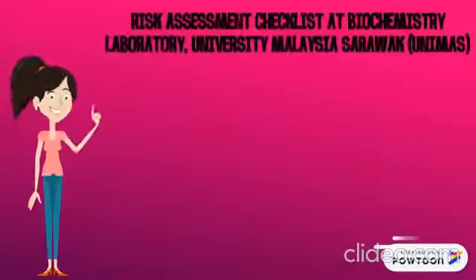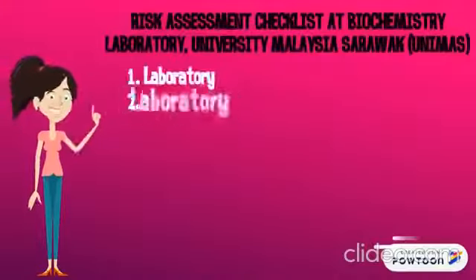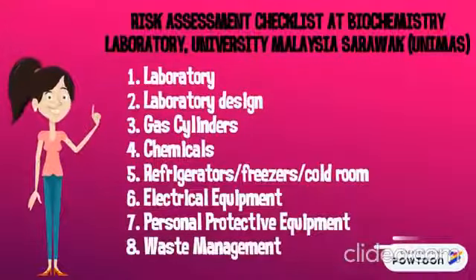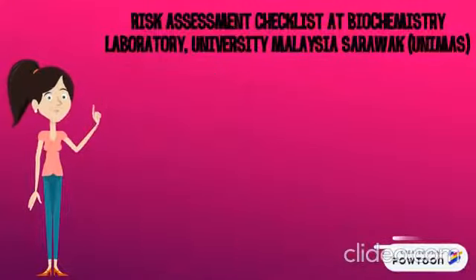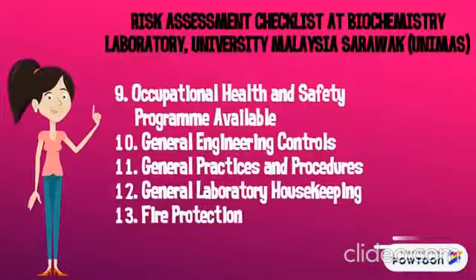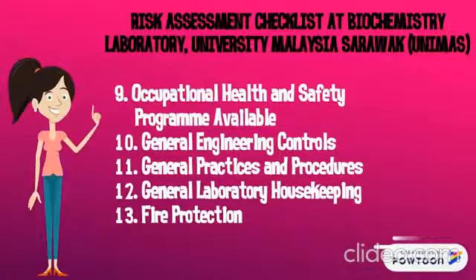The risk assessment checklist at Biochemistry Laboratory of UNIMAS contains main 13 sections, which are laboratory design, gas cylinders, chemicals, refrigerators, freezers or cold room, electrical equipment, personal protective equipment, waste management, occupational health and safety program available, general engineering controls, general practices and procedures, general laboratory housekeeping, and finally, fire protection.